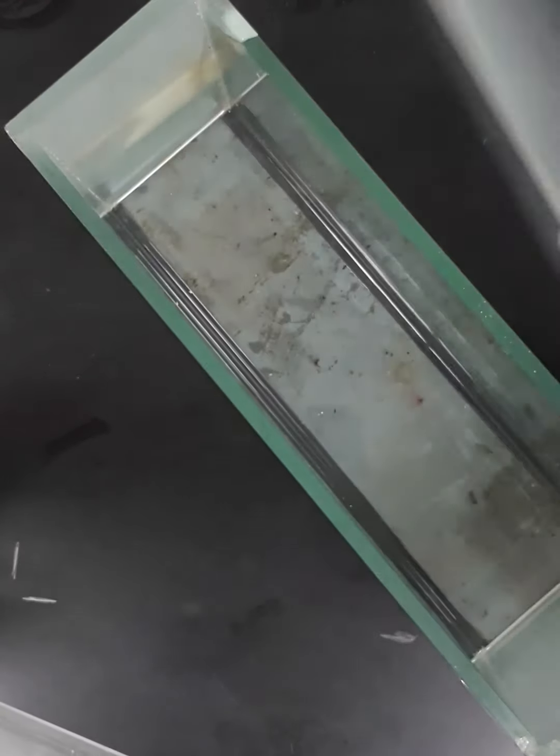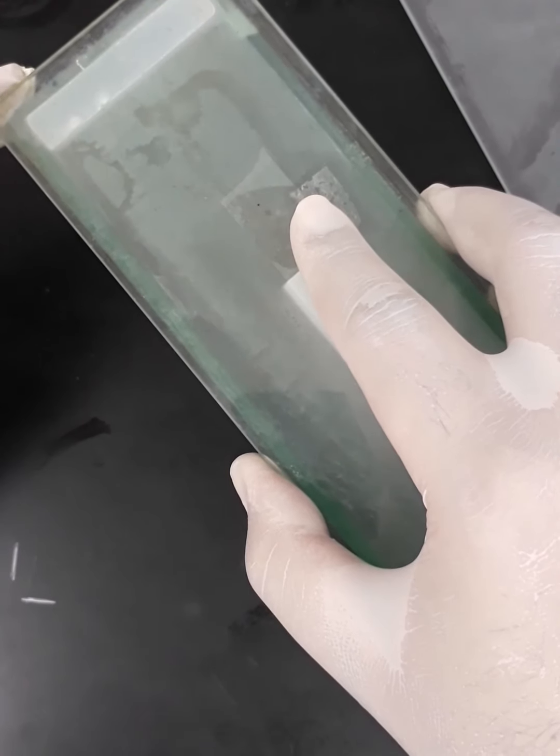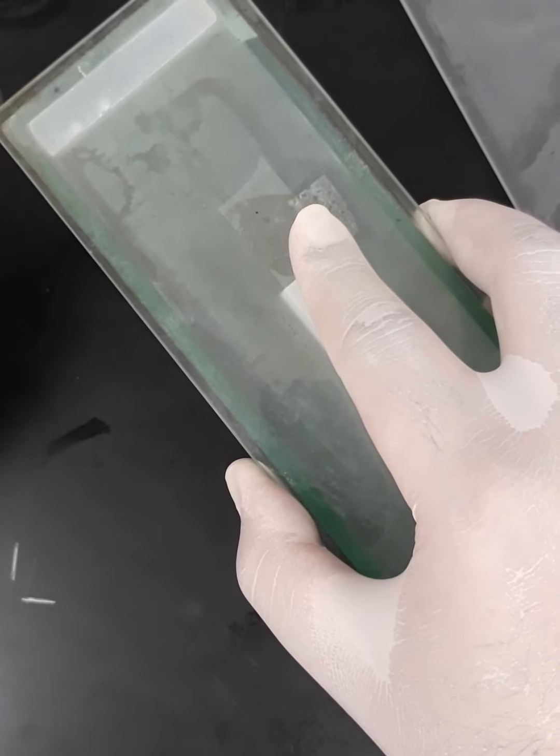So I will open the chromatographic tank, and immediately I have to replace the cover, and I have to make sure that when I place it, it has to go down in a perpendicular way. Now I'm going to observe the following development while it occurs. If you can see it, now the mobile phase is climbing up over the stationary phase slowly, and it's taking the spots up. Of course, the spots are not visible to us right now, so we have to apply a certain chemical known as chromogen, and we are going to apply it later on to localize the locations of these spots.